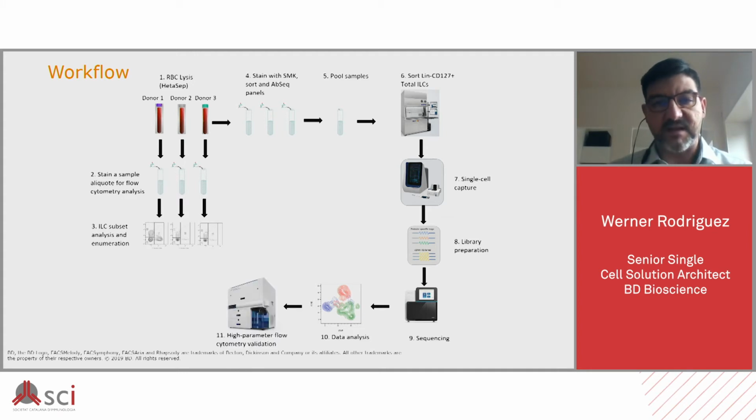And then this acts as a base for developing a new and more specific panel for flow cytometry at high parameter level.